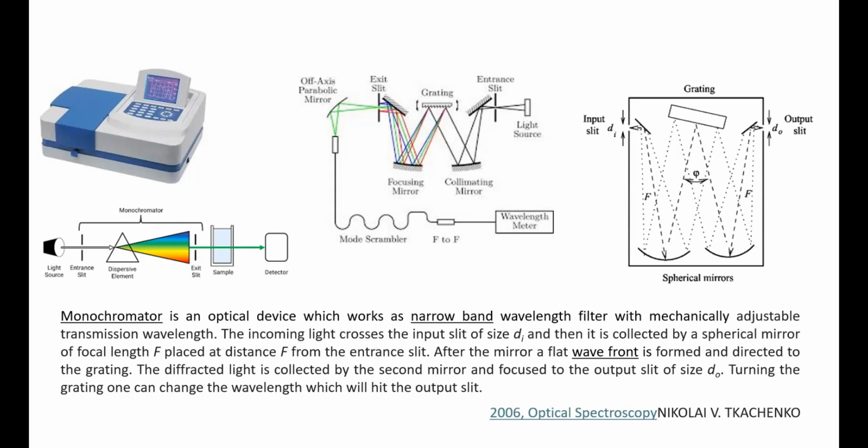You don't select a single wavelength. Here you have a monochromator, which selects a single color, but it is not limited to color alone. It is limited to the specific wavelength that you can choose: 260, 265, 280, whatever it may be, in the UV region. And in the visible region also it can select, because you have a UV visible spectrophotometer.